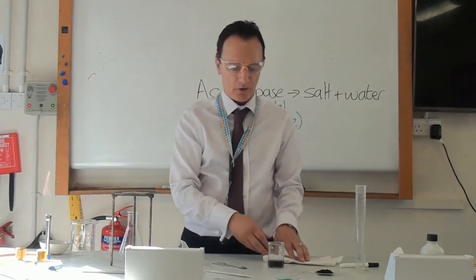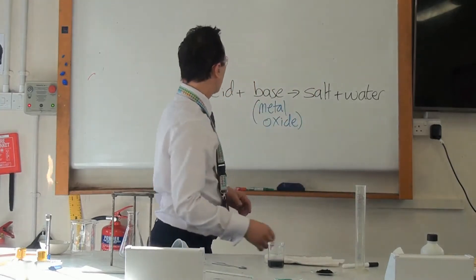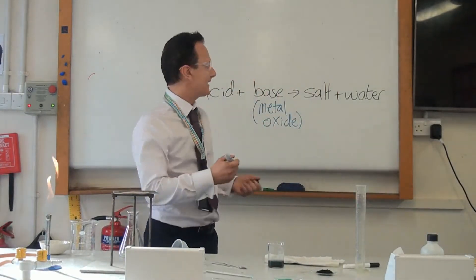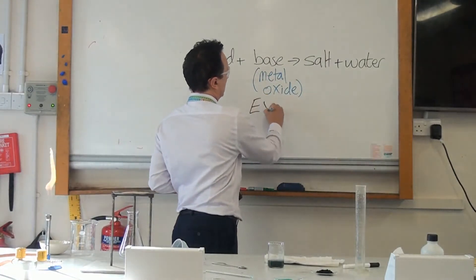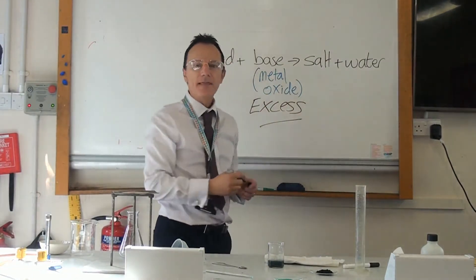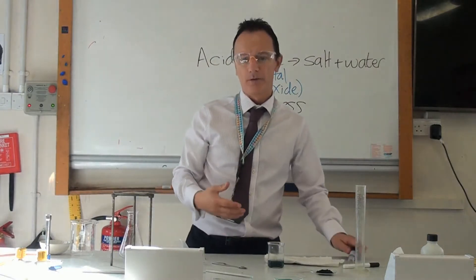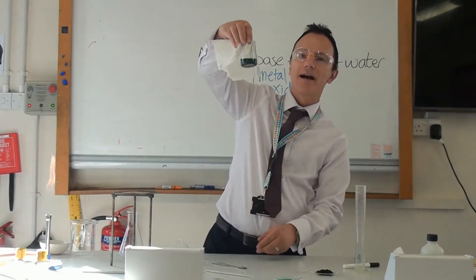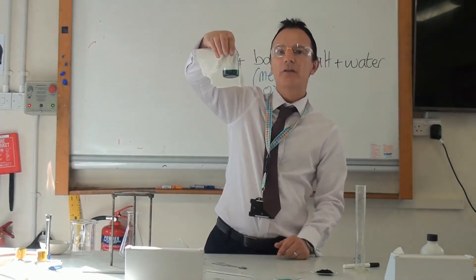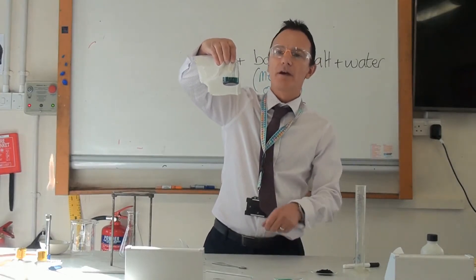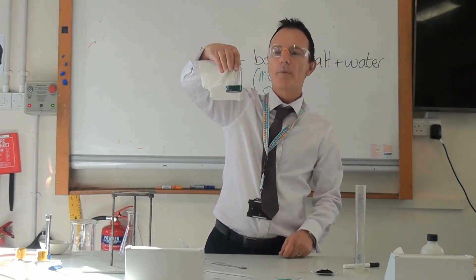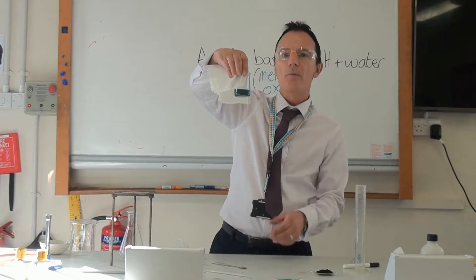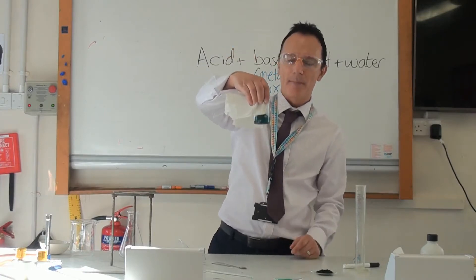Before long we will start to see some copper chloride forming. We will see the colour change into a blue colour. How much copper oxide do we add? The answer is we add excess — that means we are adding more than we need. There might still be some unreacted hydrochloric acid, so we keep adding more copper oxide until we are sure there is no more acid to react. We will know because the copper oxide will settle to the bottom and we will see the black powder forming.